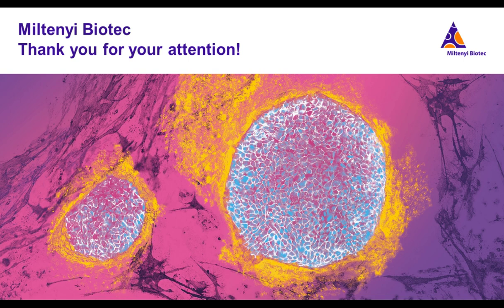Let's wrap up with this final question. How do you make sure that the images from the different cycles are properly overlaid? As I already said, we are acquiring the DAPI signal every cycle, and this is what we are using to properly overlay the images, so you can be sure that you will end up with a nicely registered image stack after the experiment. This is basically our technological advantage, to have one marker in every cycle.